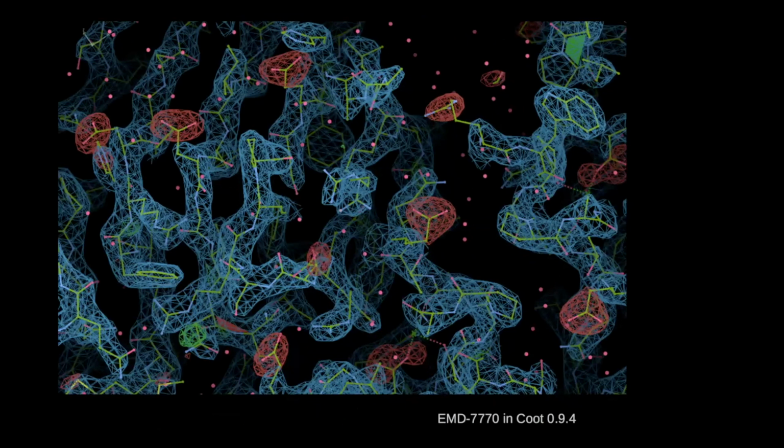And you can see here, obviously, that the formally charged side chains, the acid side chains, and maybe even that arginine out there, are covered with red density. What that means is there's more calculated density there than observed. And it might be that the scattering factors are wrong here, but it might also be that those atoms are less well occupied than they are in the model. And I currently think that is the case here.